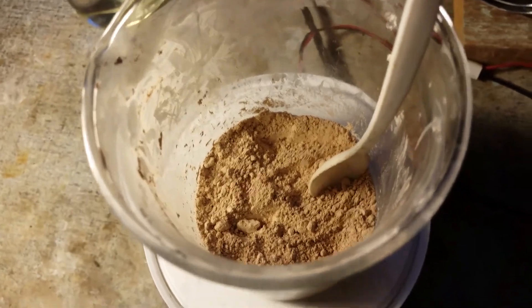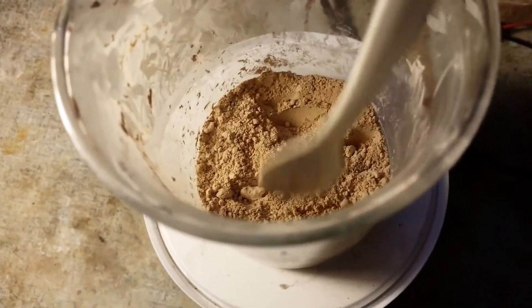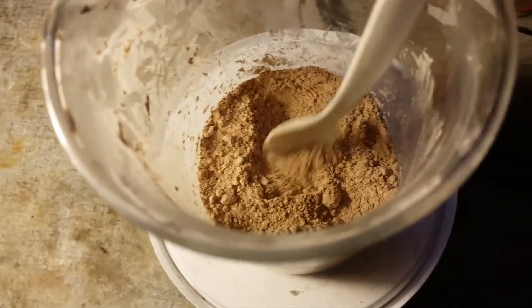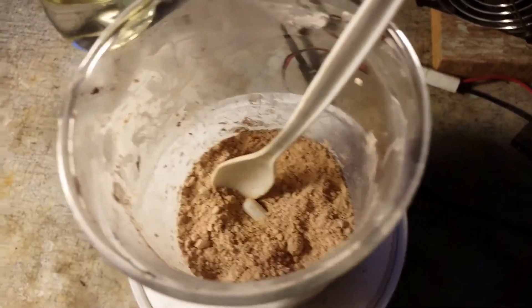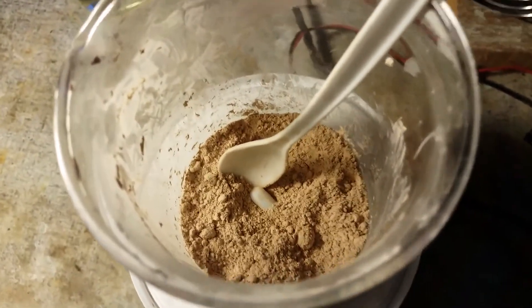Here's the manganese carbonate after drying to get rid of all leftover ammonia that might still be in there, and the next step is to convert this into manganese nitrate by just reacting it with some concentrated nitric acid.